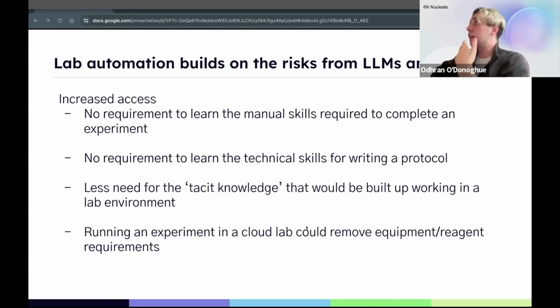Finally, if cloud labs become what they're envisioning, which is a way of democratizing science by creating cloud labs that you can use anywhere, that in theory removes some of the barriers of cost and reagent access. If you can get into a cloud lab, they may have compounds you can't find elsewhere. They may significantly reduce the cost of otherwise setting up your own lab. This also creates a risk of access. So that covers some of the access side of the risk.